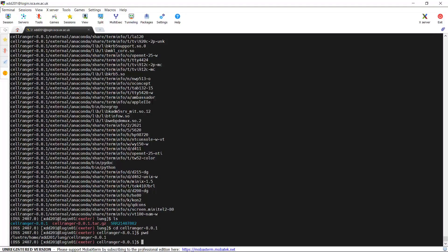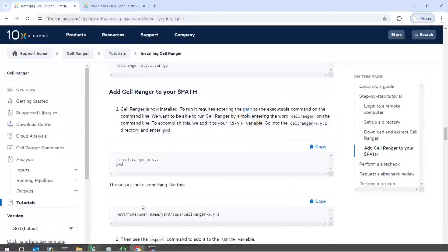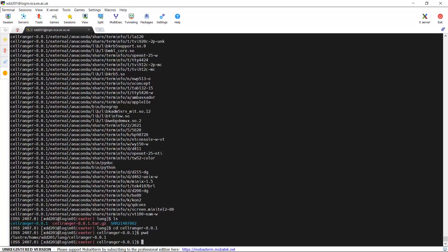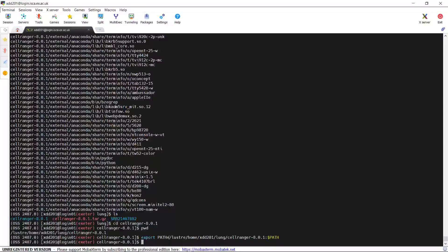Next we use the export command to add CellRanger to our PATH. If you are installing the software on your own account, you can use your own path. Here I have my path, and I use the export command with my path. Now we should be able to run CellRanger from my account.